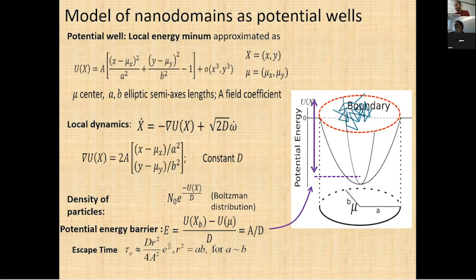So let me repeat this. You have many trajectories. From these trajectories, you cannot calculate the escape time, because for this, you need to reconstruct the boundary. Once you have the boundary and you know the properties, you can use this to get information about the stability of your structure by calculating a quantity that you could not calculate with just the trajectories.